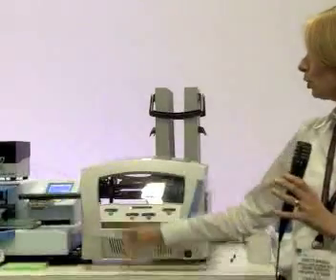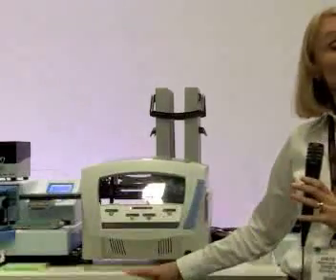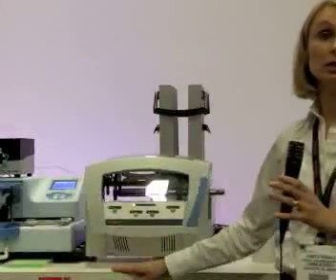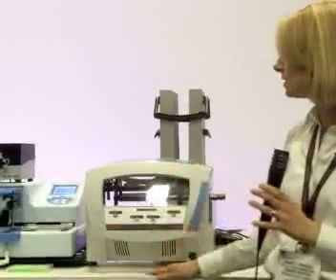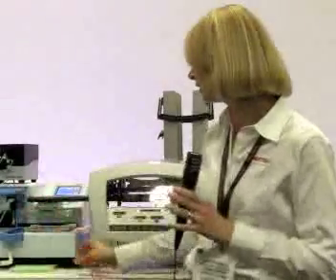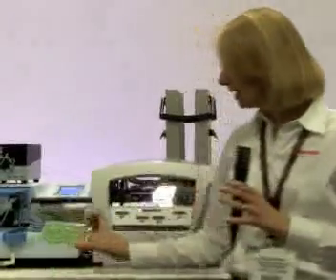Right now, we have it running a protocol where it dispenses one reagent into every odd nest, and then it dispenses a different reagent into the even nests, and then it restacks it. So, as you can see here, we have the color blue in for one reagent, and we have a color yellow for another reagent. So, you'll be able to see here what the end result is.